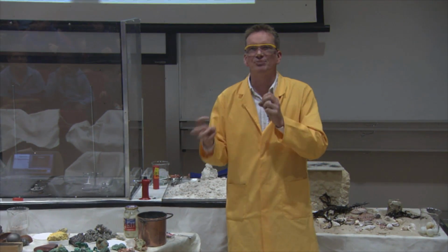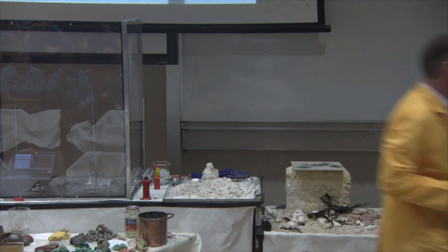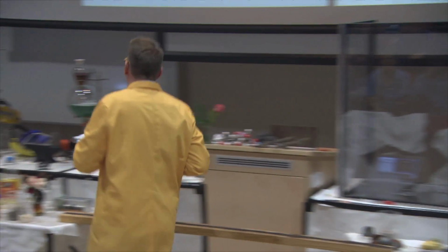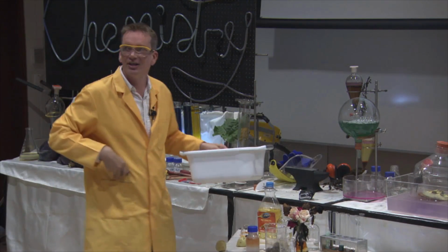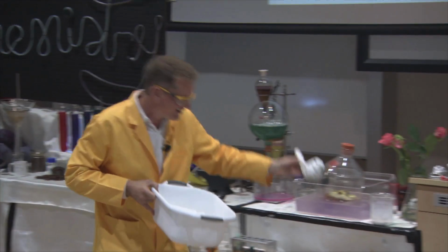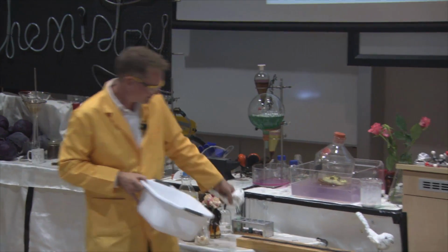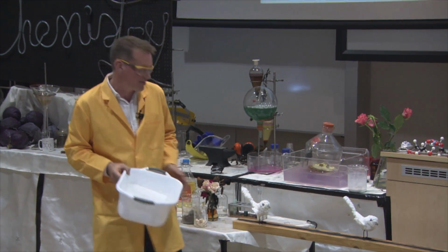So I want to show the difference between just mixing things coarsely and, well, locking it into the chemical structure. So we've got some compound here where we've some nitrocellulose. So I've got some nitrocellulose in here. This is, remember, where we've locked in the extra nitrogen and oxygen. So here's cellulose, here's nitrocellulose. And so I'm just going to put some of this on the track. And it's a little bird. There we are. Okay. We'll put him there. So here he is. So he wants to watch all the fun and excitement that's going to happen.